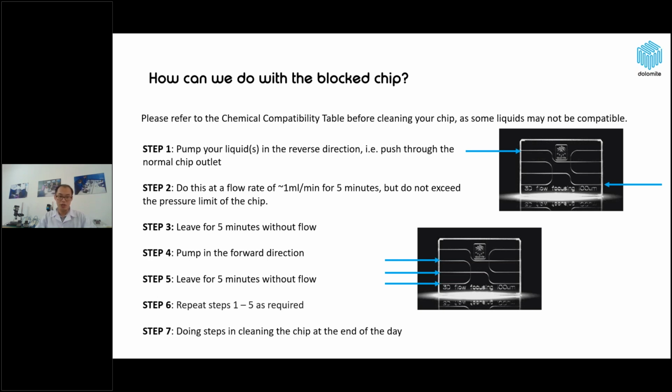So here we suggest a protocol including just the steps listed below. Just remember, before doing these steps, please refer to the chemical compatibility table, so you can avoid liquids not compatible with your chip, which can destroy the chip during the cleaning step or the unblocking step.